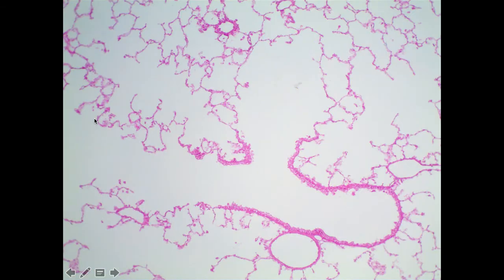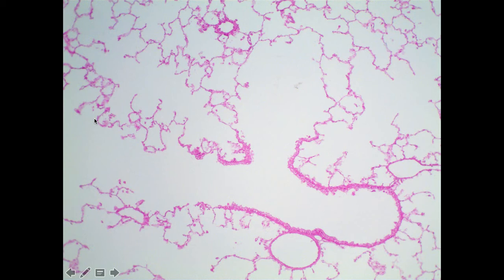So that's the trachea. The key features are the pseudo-stratified ciliated columnar epithelium with goblet cells, the C-shaped hyaline cartilage rings on the anterior and lateral surfaces, and the trachealis smooth muscle on the posterior surface. The other slide we have is the lung, which contains a few structures. The first on our list are the bronchi — the larger conducting tubes that arise as the trachea branches. The key identifier is that bronchi still have cartilage, so if you see a tube in lung tissue with cartilage, you are looking at a bronchus.